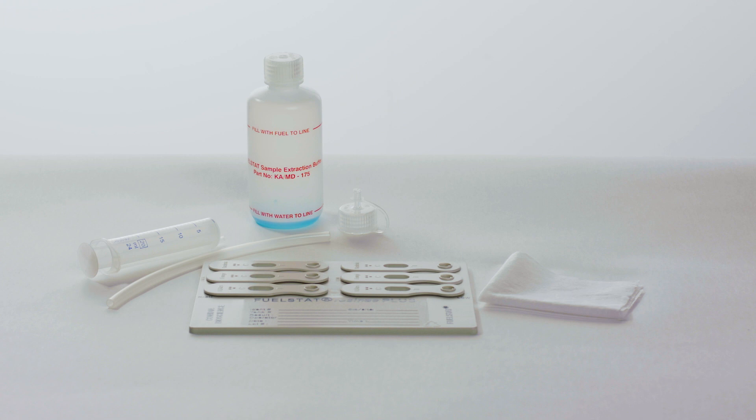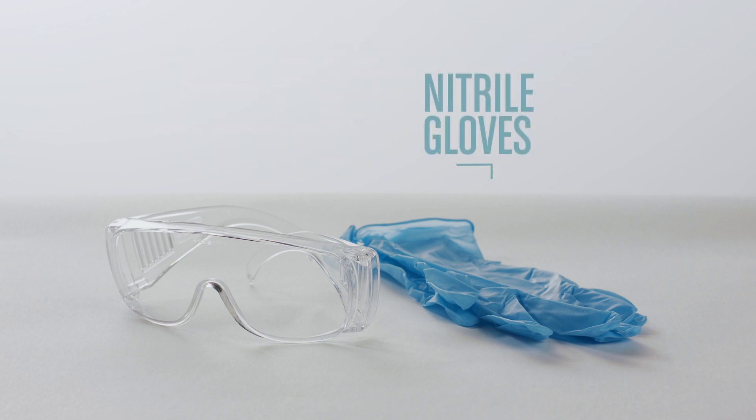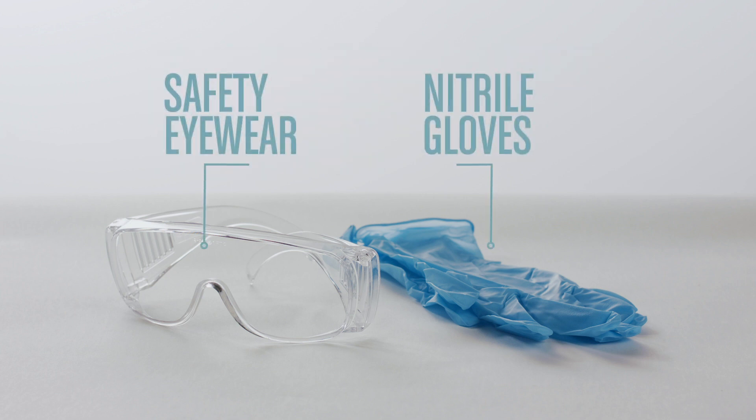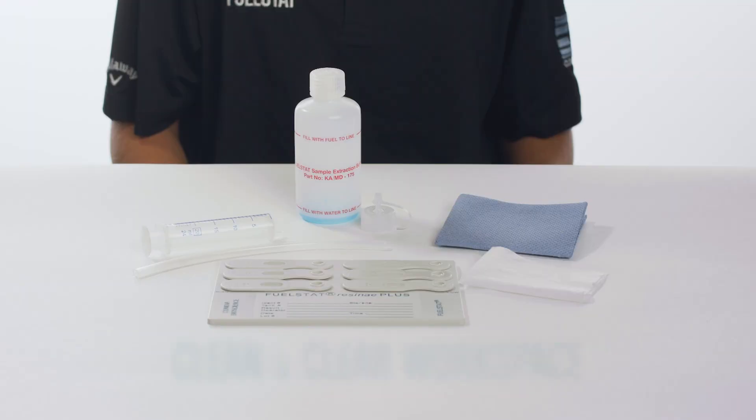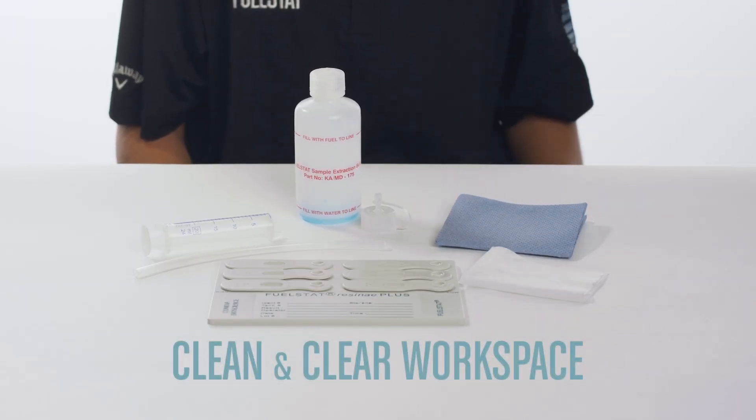Before starting testing with FuelStat, adhere to internal policies on using PPE when handling fuel. Nitrile gloves and safety eyewear are generally recommended. Have a clean, clear workspace and some paper towels on hand. You are ready to start.